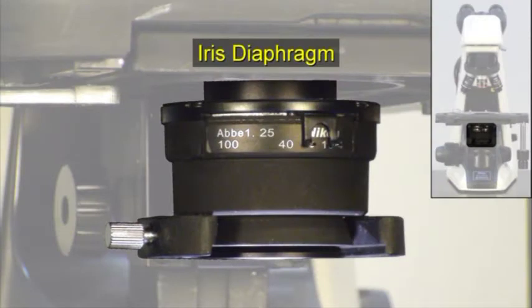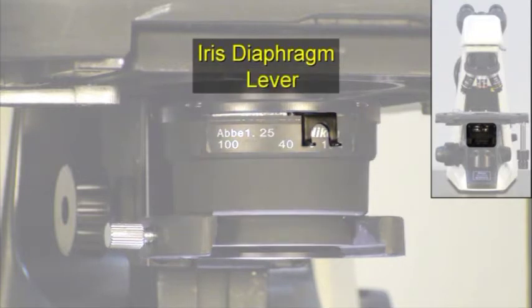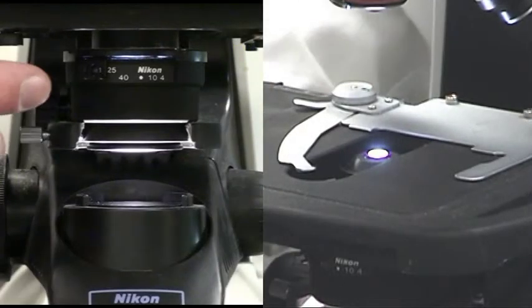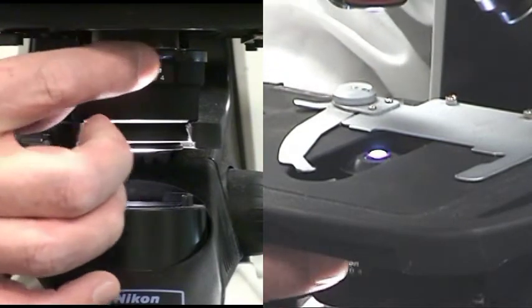The iris diaphragm is the large structure attached to the underside of the stage. It controls the amount of light that passes through the slide. Moving the lever opens and closes the internal iris aperture to change the amount of light that passes. This is your primary light adjustment, which also changes image contrast.